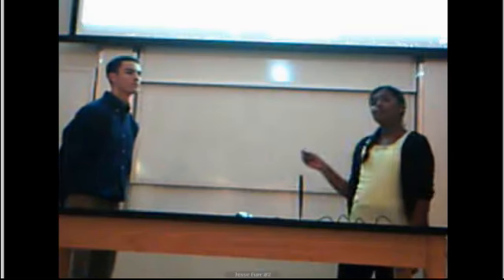All right, so a little bit about fluorescence spectroscopy. First things first, this is a cartoon. What this guy's doing is shining a light into a quartz cuvette, which is what is put into the fluorometer, and then he sees a chemical compound. That's basically what we're doing, except that we get a graph output instead of an actual chemical structure. We interpret that graph to get a chemical structure, and then we figure out what the chemical is.